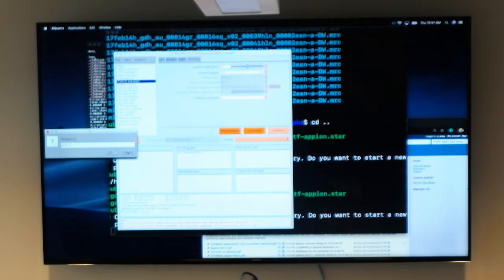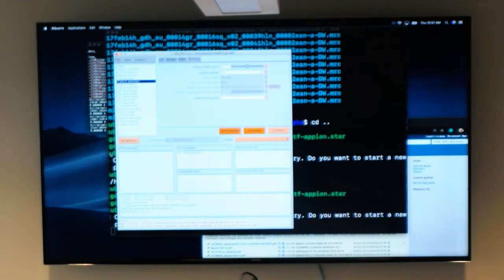I can change the alias and say this is GDH bin 2 or whatnot. So you can now change that. The alias in the file system is still going to be job 1 in this case, but this can be labeled as something more intelligible.